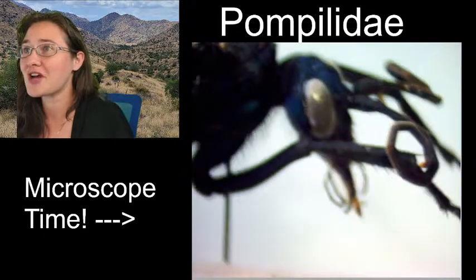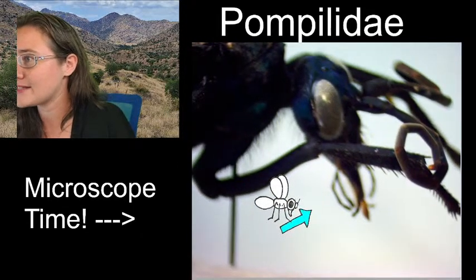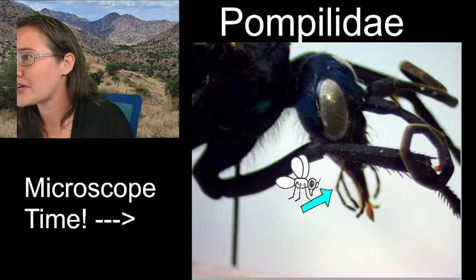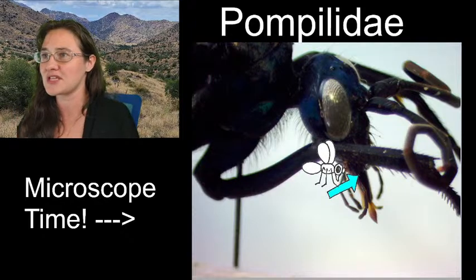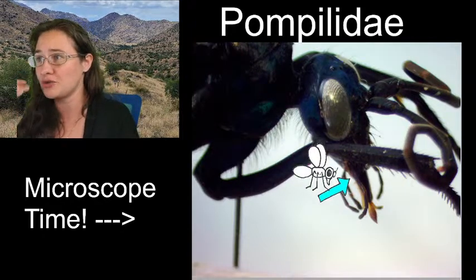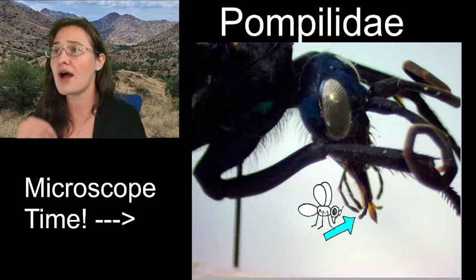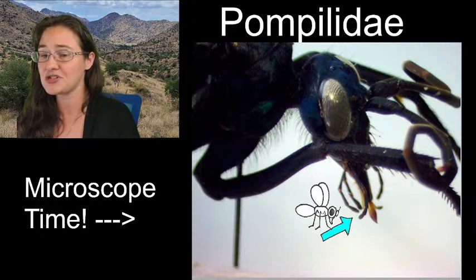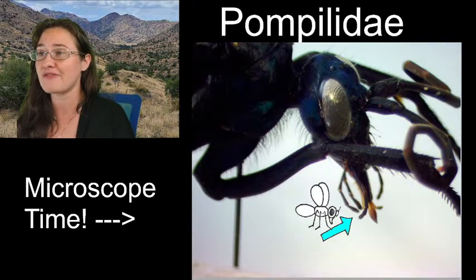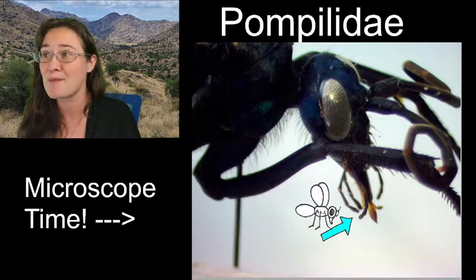Her mouth parts are pretty obvious. We've got Terry here to help us out. Let's see. Her mouth parts are kind of fun because if we look at her head on, we're going to see that she has both mandibulate or chewing mouth parts and this straw-like part of her mouth. So as an adult, tarantula hawks a lot of times feed on nectars and sugars. So you'll find them at freshly flowering plants or even at trees that are gushing sap. They're really, really hunting for sugary natural goodness.